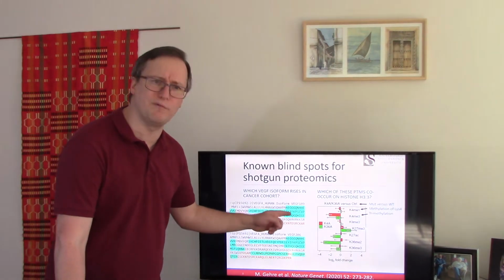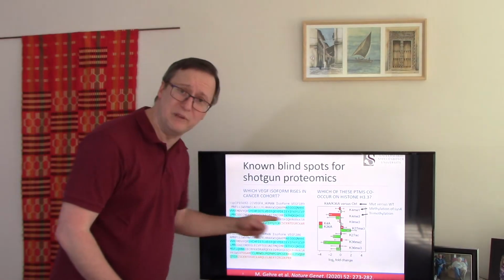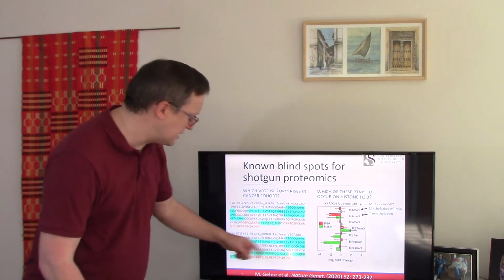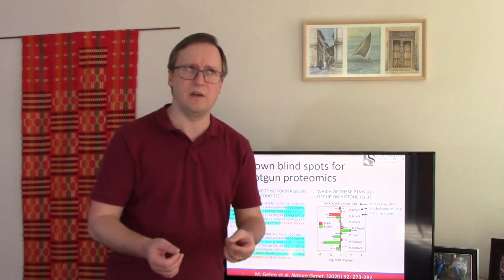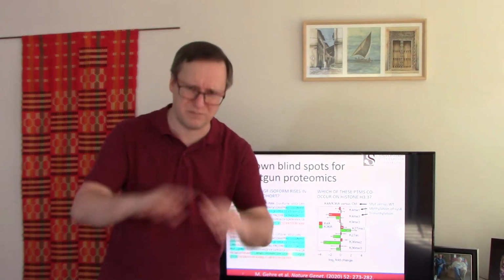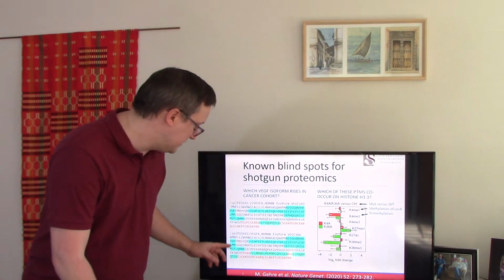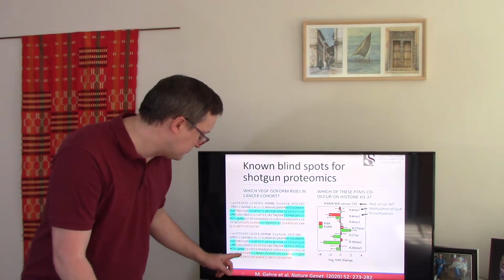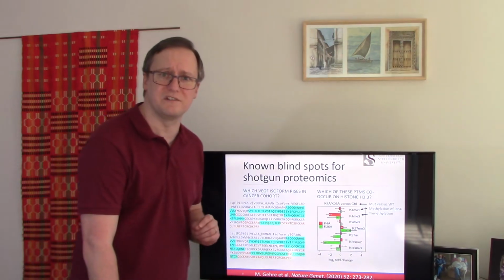Now, as I recall, VEGF 189 is normal. If you go hunting in cells for VEGF, this is probably the version you're going to see. Down at the bottom, we have a much rarer transcript that is found. I don't know if it's associated with cancer. I've just mocked up an example here, but it's clearly a different sequence, right? We see that this region down here in orange differs between these two sequences.